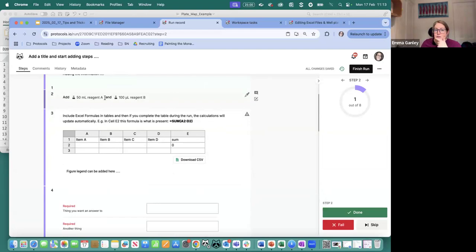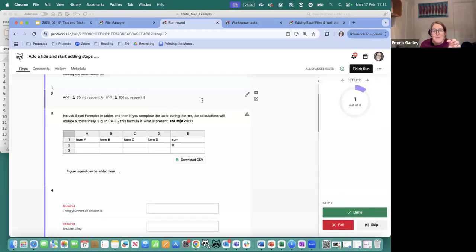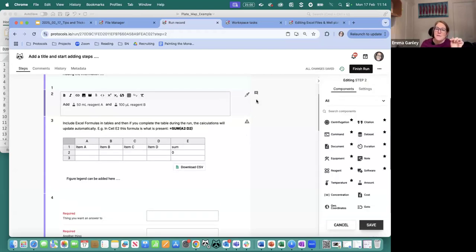If I've added quantities here, actually, if there are quantities all throughout a protocol, that it's some kind of master mix, the entire protocol, you can choose to scale the whole protocol. Or if in an individual step, there are quantities just for creating one thing, maybe you're making a buffer, then you can choose to, now I can't see where my options are. Oh, here we go. I need to edit or scale.